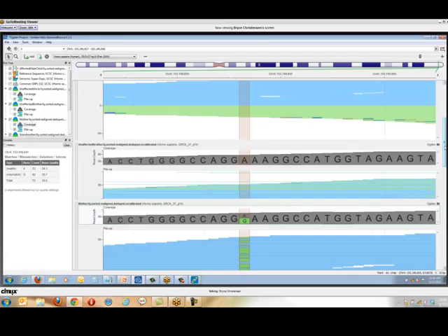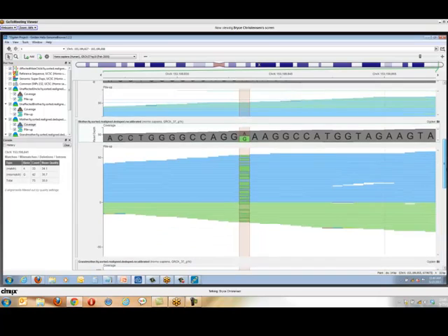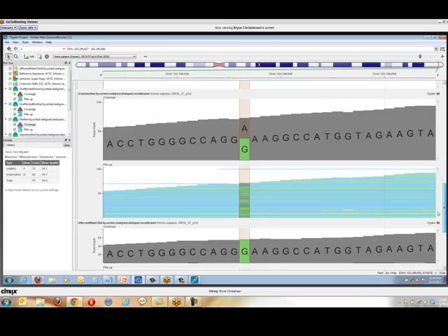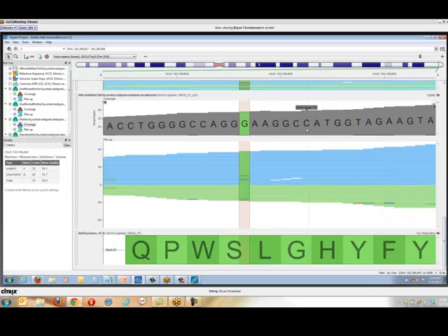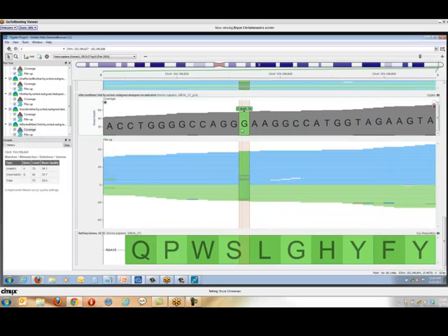We go further down. We also see, in the grandmother, a nice heterozygous pattern, and in the affected male child, click here and see, whoops, where's my data? There it is, 56 reads. They all are for the G. Looks like a clean homozygous variant.